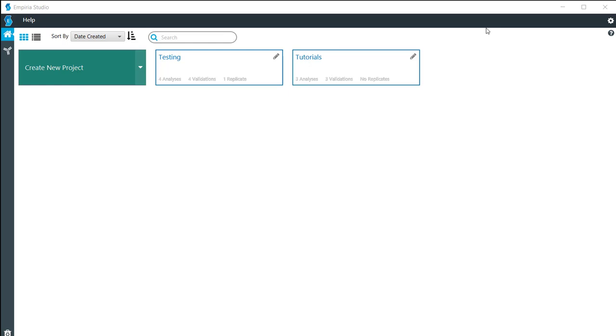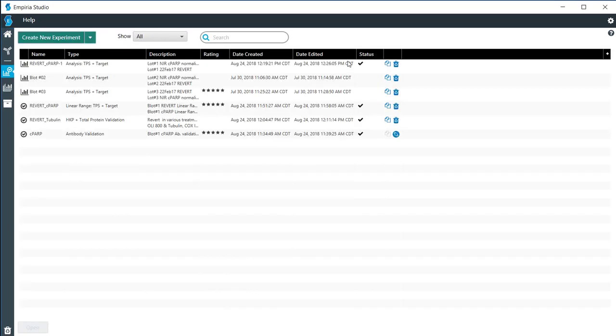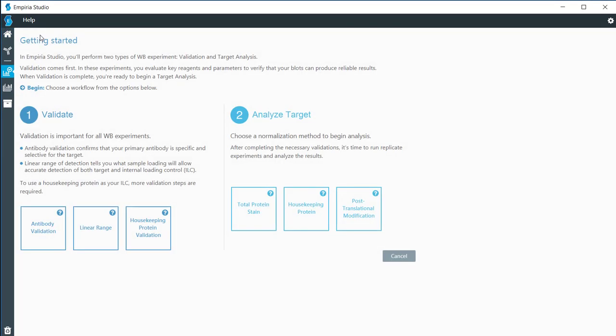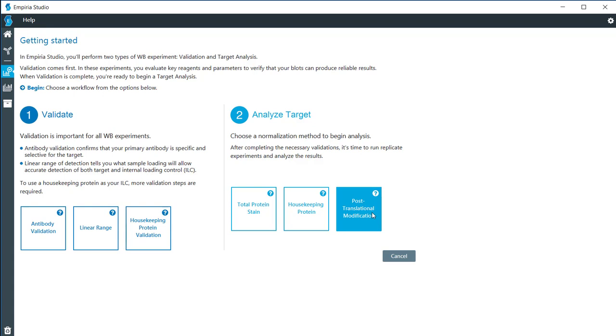In this video, I'll be walking you through the steps of analyzing a target with either a housekeeping protein or a post-translational modification. I'm going to move into the tutorials project right here and click on new experiment. This video combines both the housekeeping protein and the post-translational modification because it's the exact same steps all throughout the process.